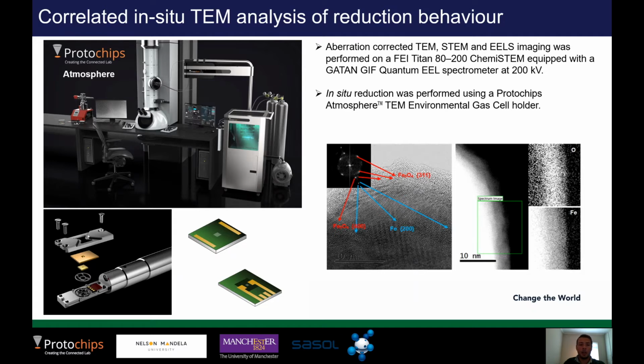One of the most important reasons we ended up using an in-situ system was that iron really readily oxidizes in an ambient oxygen environment. It forms surface oxide layers when you just expose it to air. We really tried to avoid that in this study because this could complicate the interpretations that you make from successive reduction steps quite a lot.